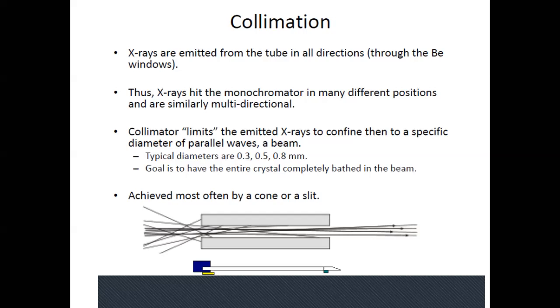So you have your source that produces the X-rays because it hits that metal target. You have the monochromator with the beta filter that only selects the K alpha radiation. Then you have a collimator that puts all those K alpha photons into a uniform beam, and now you're ready to strike the crystal with your X-rays.